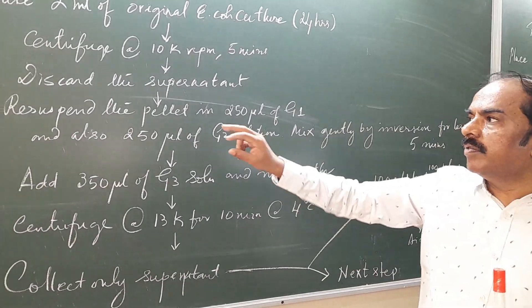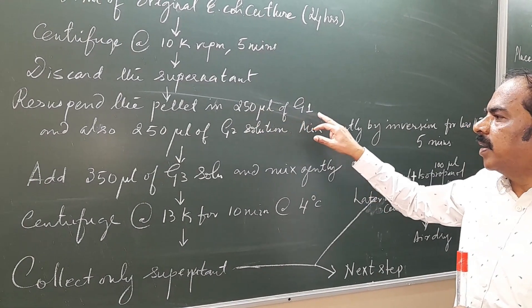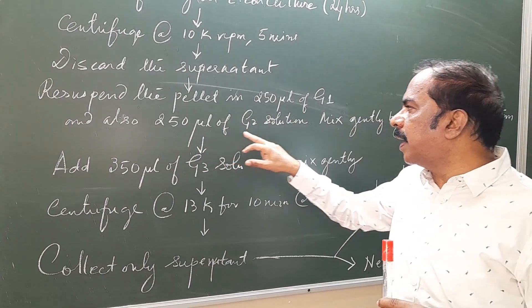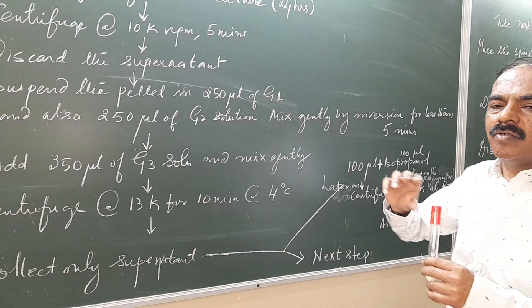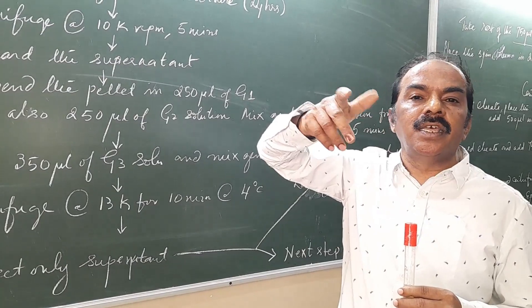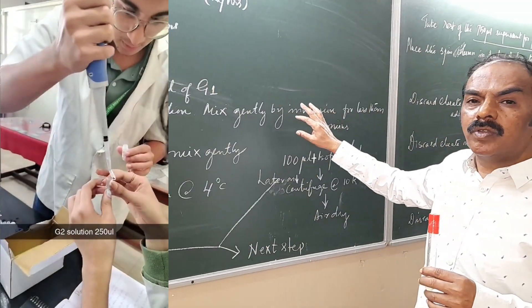There will be a pellet at the bottom. Take only the pellet and add 250 µL of G1 solution, and also add 250 µL of G2 solution. These solutions come in the kit. Mix the solutions gently by inverting — just tilt the tube — for not more than 5 minutes.